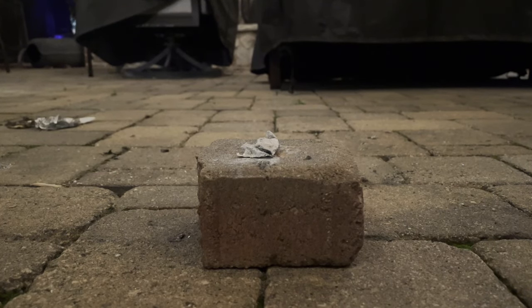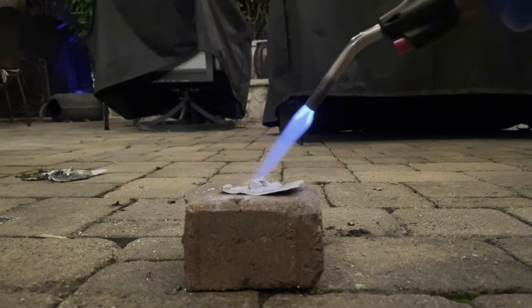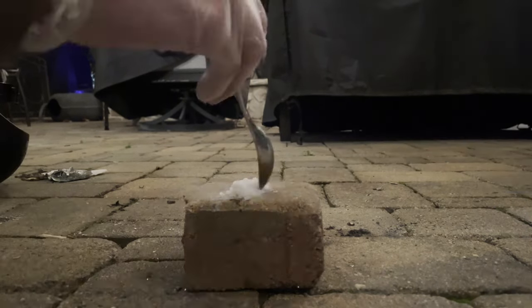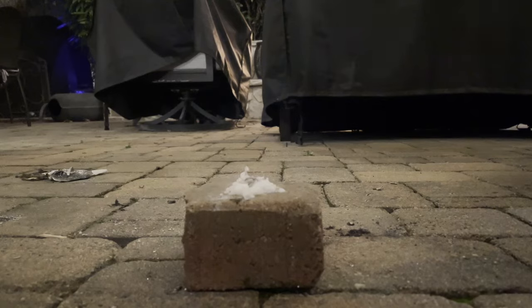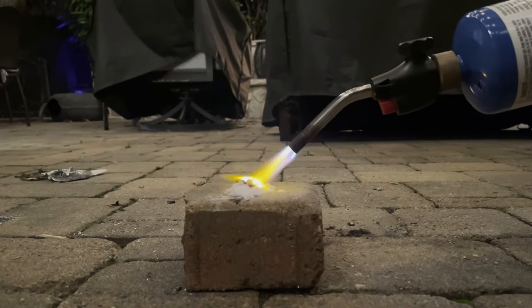Now we're going to move on to sodium. After again having problems with the sodium just melting and not actually reacting with the dry ice, I had to do the paper towel method again, even while it was cut up into small pieces and mixed in with powderized dry ice. This time the sodium was able to light on fire, but it wasn't very impressive because it didn't really mix in as well as I thought it would with the dry ice — it kind of just stayed together in one blob.